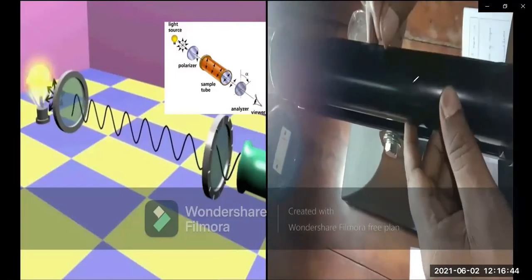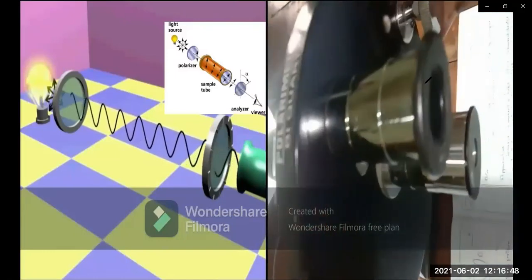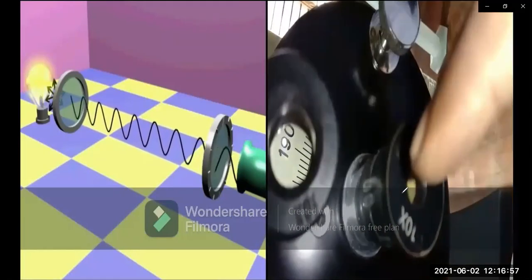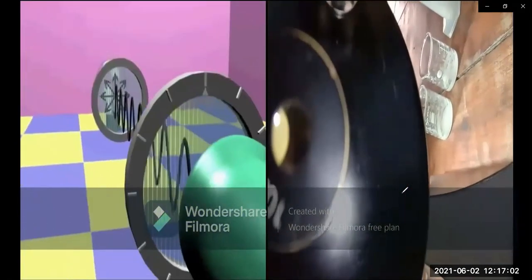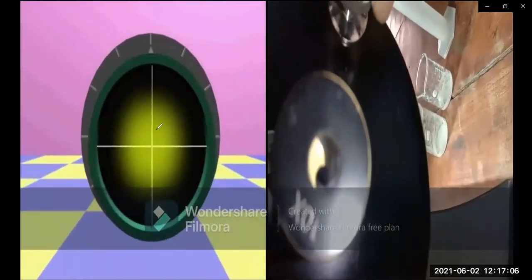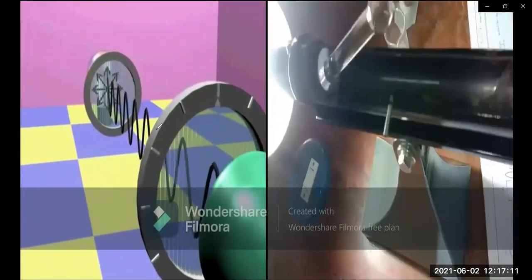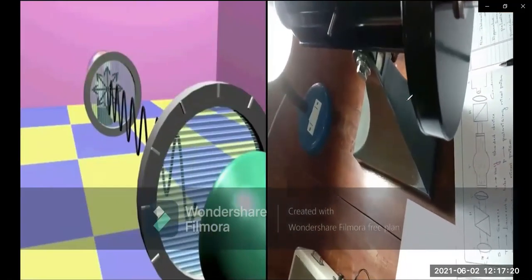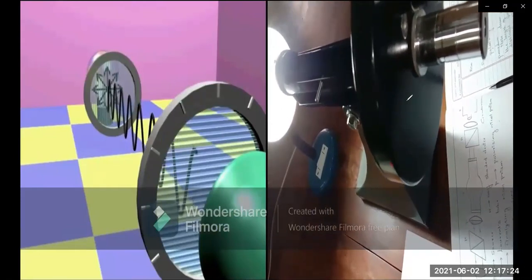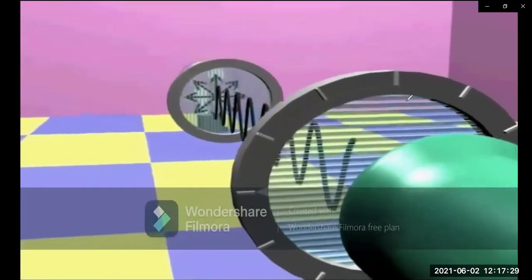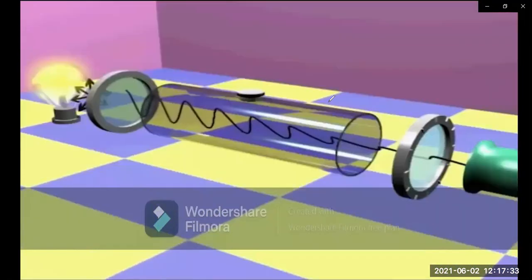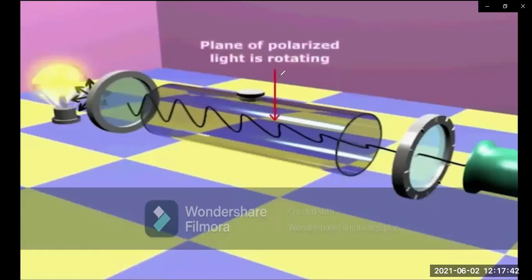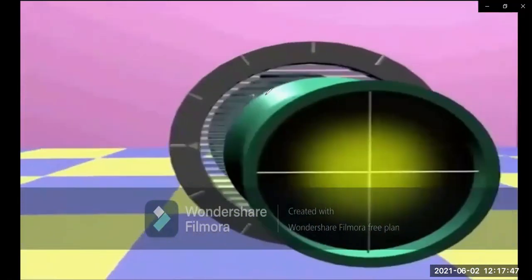This is the solution. This solution is optically active.